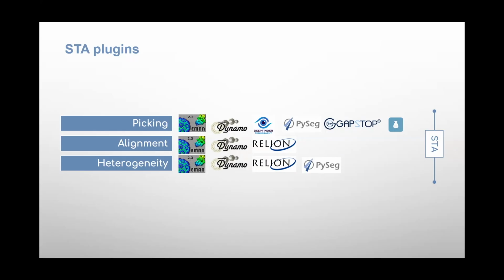For aligning, you can align your tomograms with EMAN, the full pipeline, Dynamo, or Relion. And for the heterogeneity, that means classification, well, EMAN, Dynamo, Relion, or PySeg.